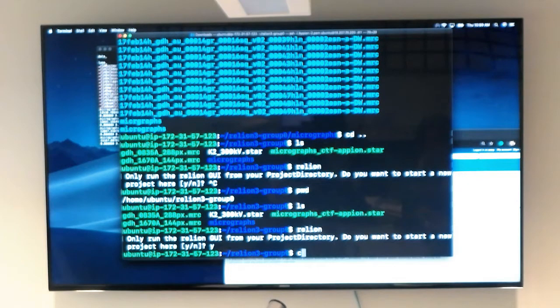We'll come around and see if there are any issues that you run into. But the idea is for you to start using this as a practical, not by me just saying, take your hand, move it here, and press this button, but for you to have a data set that you can play with. If you don't feel that you want to work with the GDH data set, I did point out you have a couple other data sets that you can play with.